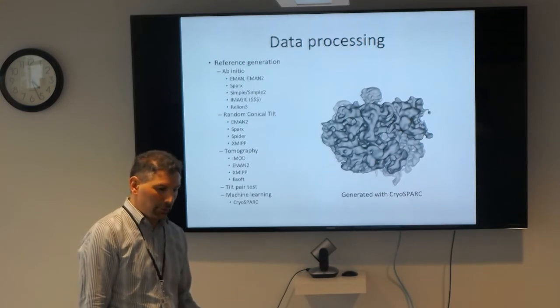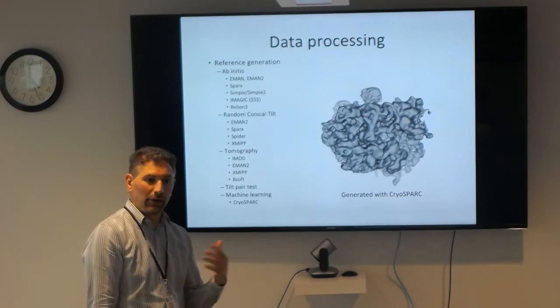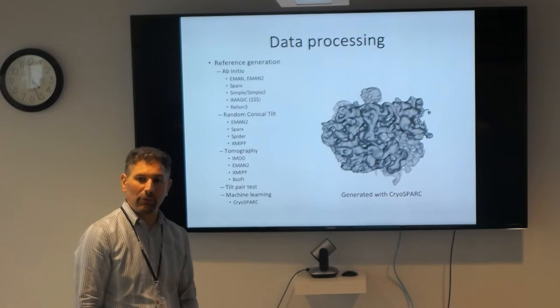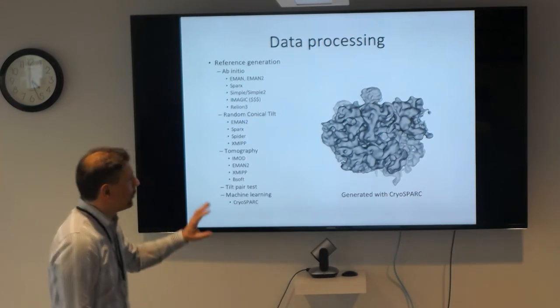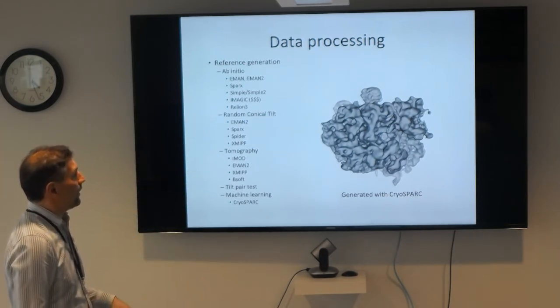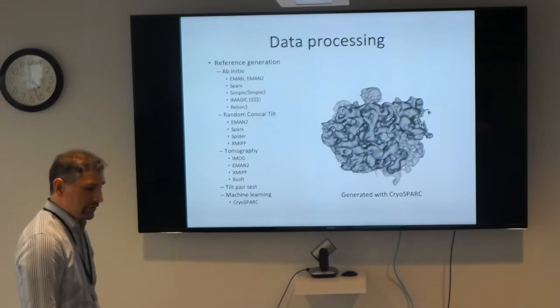And a lot of the programs, for example, Dynamo, reminds me of how Spider thinks and how Spider used to work. So I can make that analogy and I can understand Dynamo a little bit faster than someone who's just changing variables and trying a couple of different things. So knowing some of these older programs, for example, Spider, actually helps you out with the tomography aspects as well. So, different ways of doing tomography.